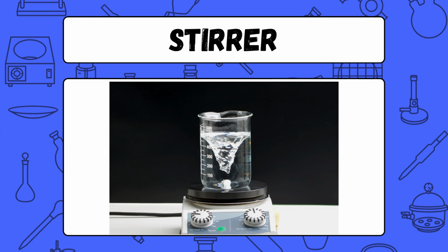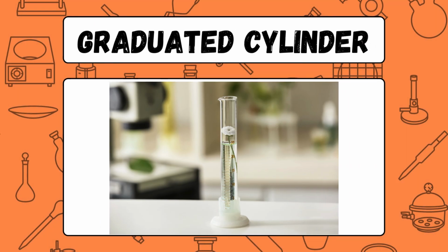Stirrer. A stirrer is a tool used to mix or stir substances, typically liquids, in a container. Graduated cylinder. A graduated cylinder is a cylindrical container with marked measurements, used to accurately measure liquid volume.